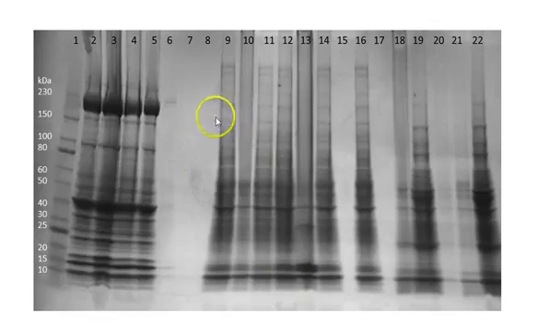Thin bands like here, these narrow, very faint bands, there aren't many copies of that protein. And then abundant bands like this really abundant band here in the heart, and down here, those are lots and lots of copies. So this is a protein that there's a lot of in the homogenate.